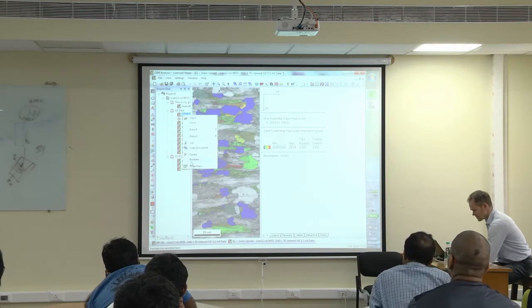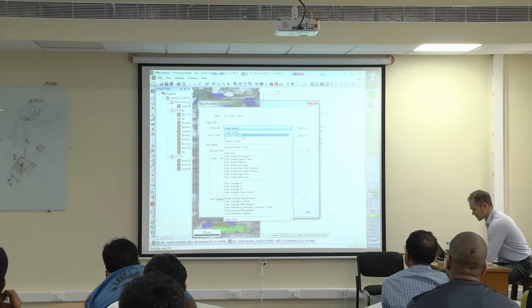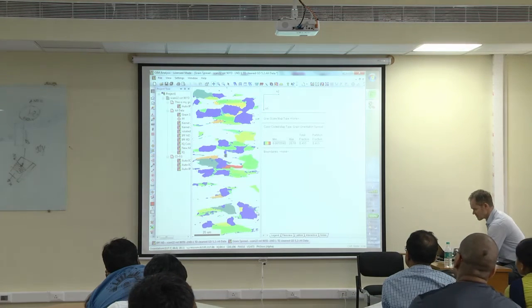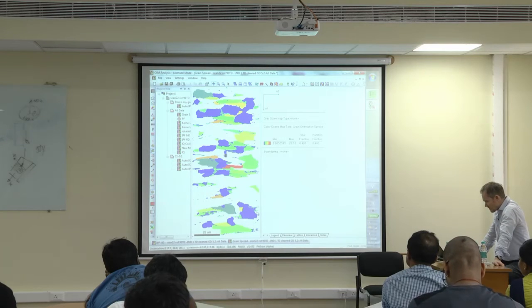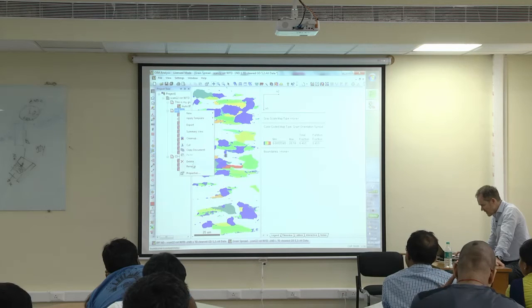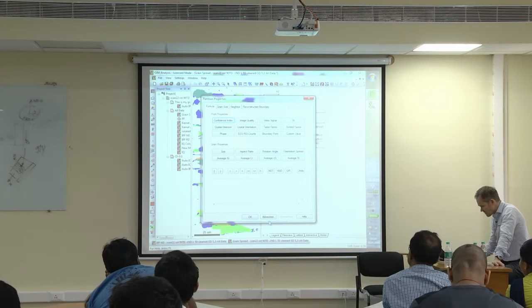It is this one, yeah? Properties. Grain orientation spread. Yes. Let's take that off here. None. Okay. Why is that? Why is it not plotting all grains? I don't know yet. Have I made any restriction of my partition? No, I have not.